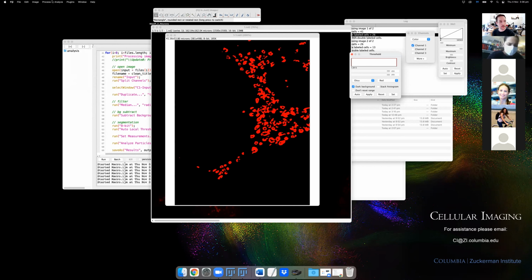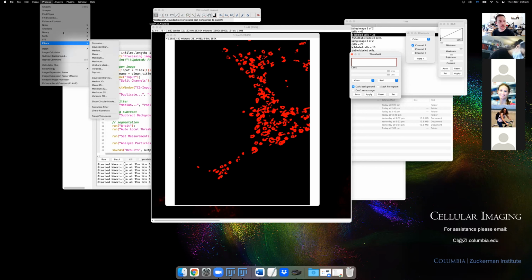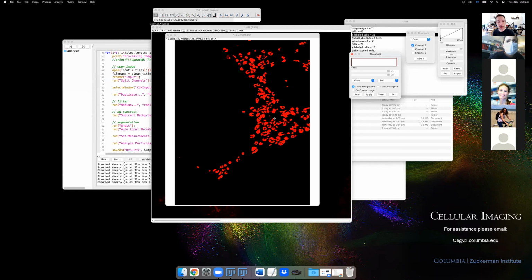And another thing which we used in the previous session is watershedding. This is trying to find boundaries between objects. I wouldn't use it in this case because it's pretty aggressive, but we can put watershed in. You can see how it will artificially break all these guys up. So maybe if you were trying to separate them a little bit more, you could use that. But I feel like that's a little bit too much in terms of separating.